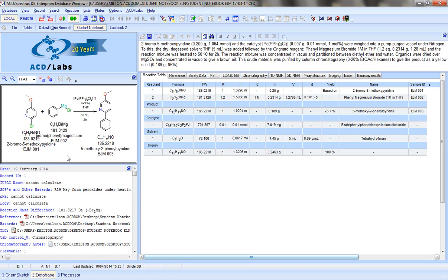Welcome to ACD Labs Student Notebook, an application of Spectrus DB. The Student Notebook is an electronic laboratory notebook databasing system to help you streamline your workflow and give you easy access and archiving of your laboratory data. The Student Notebook will help you process your analytical data and document experimental information effortlessly.